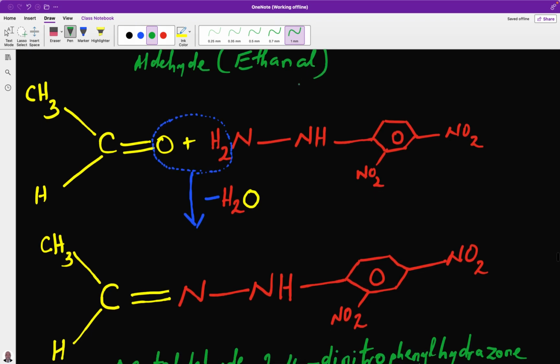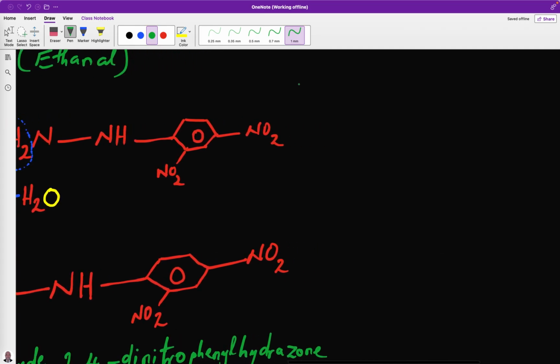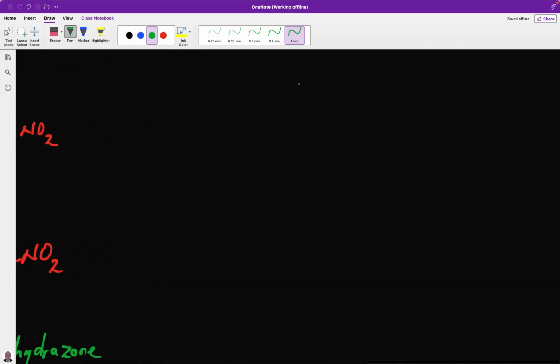Now, we want to go to the reaction between ketone, and our example will be acetone, or propanone.